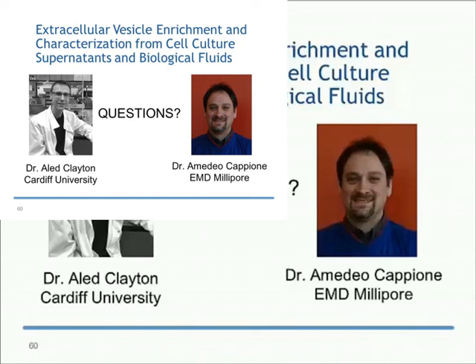Okay, next question. Which method do you think is most suitable for large-scale isolation procedures? Yeah. I would ask what is meant by large scale? You know, we're talking 50 mL? That's not specified in the question, okay. So you'll have to define it yourself, I guess, in your answer.